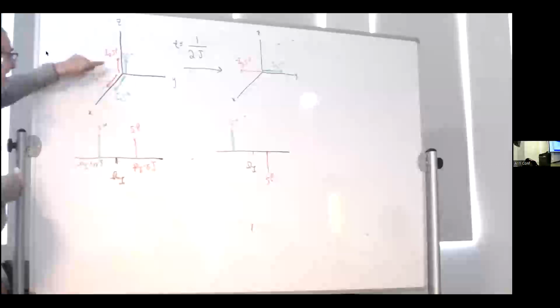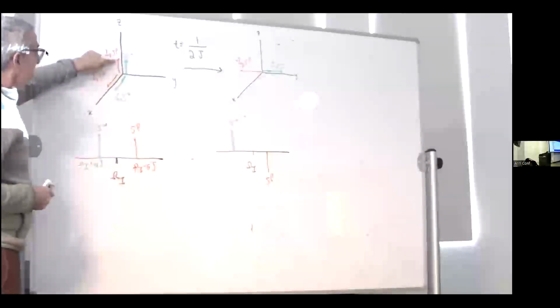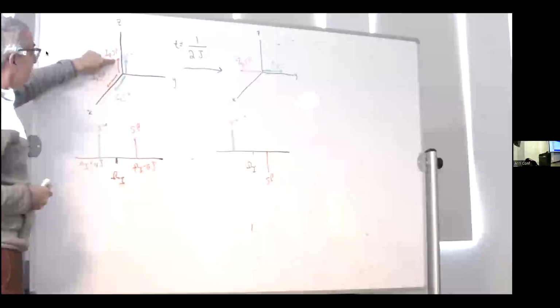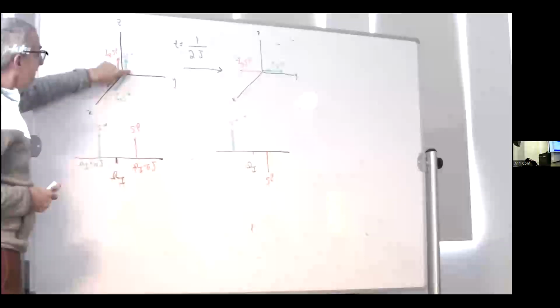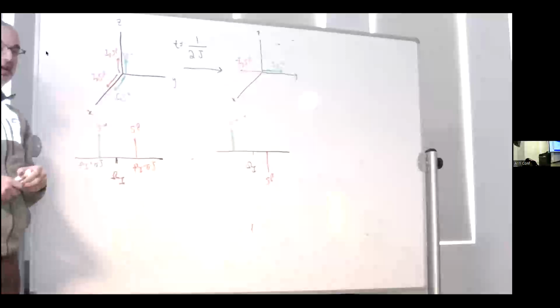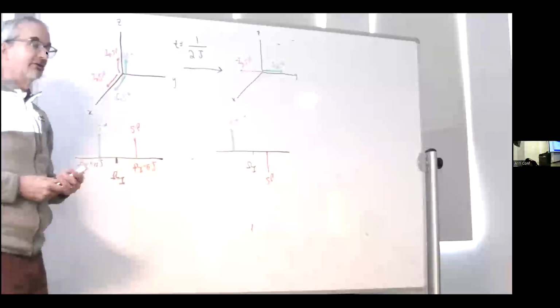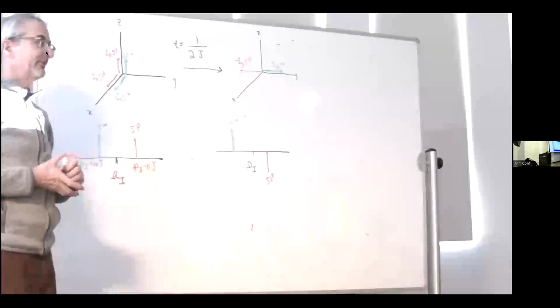So I've indicated that here with the proton Z magnetization connected to the beta nitrogen in orange, and the proton Z magnetization connected to a nitrogen in the alpha state in green. And the total magnetization is just the sum of those two.